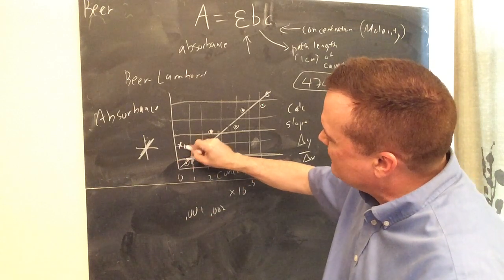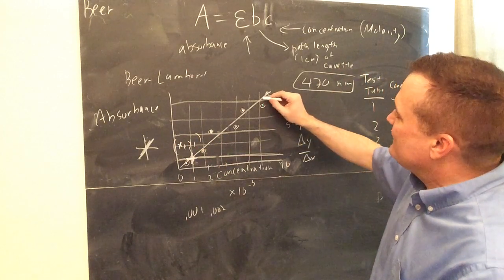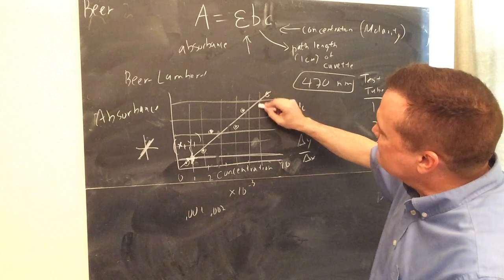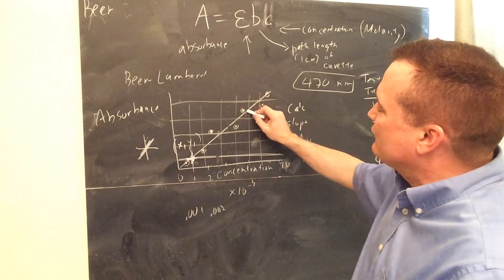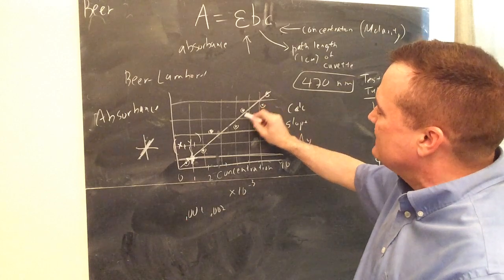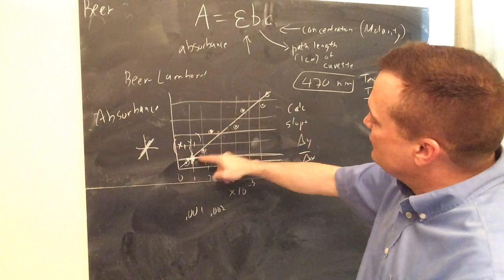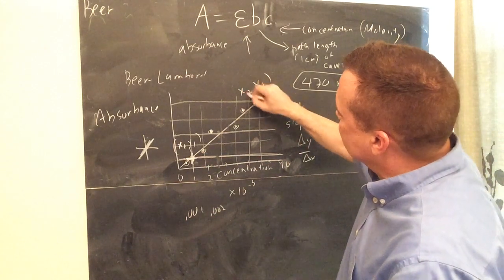We'll call that x1, y1. Then you go up here, and look, what do you know? Here the line intersects exactly through a cross. See, right here it doesn't. Here it's only going through this one line. That's not a good point. That's not a good point. That's not a good point. That would be a good point also. But take 2 as far apart as possible, and that'll be x2, y2.